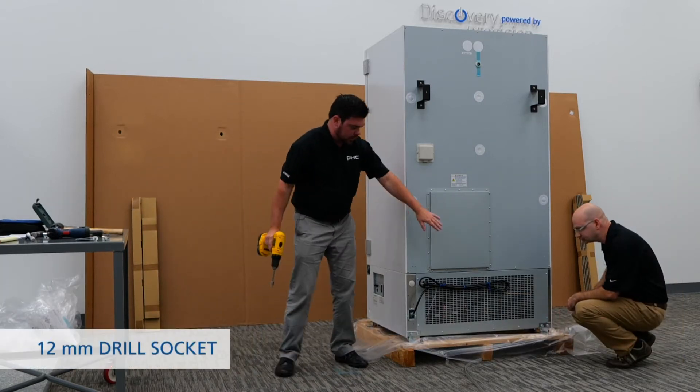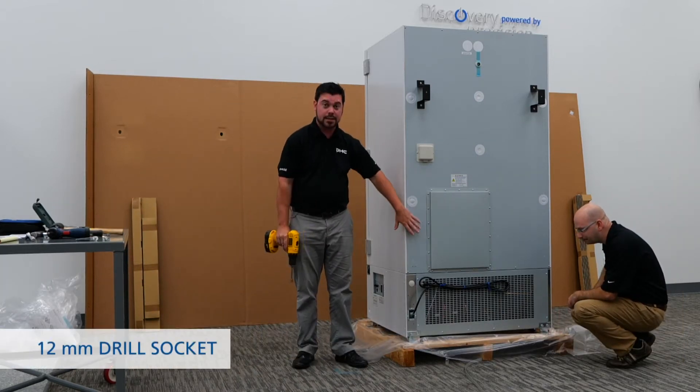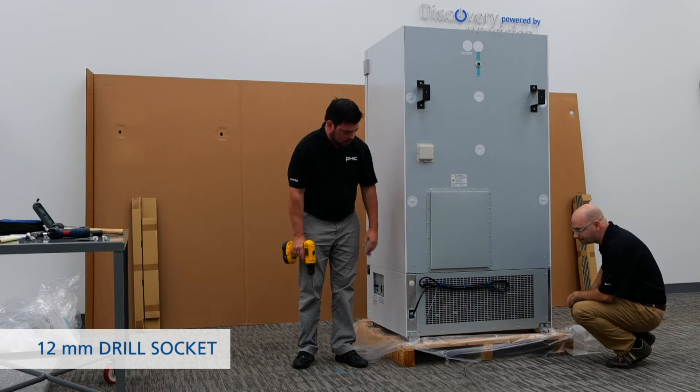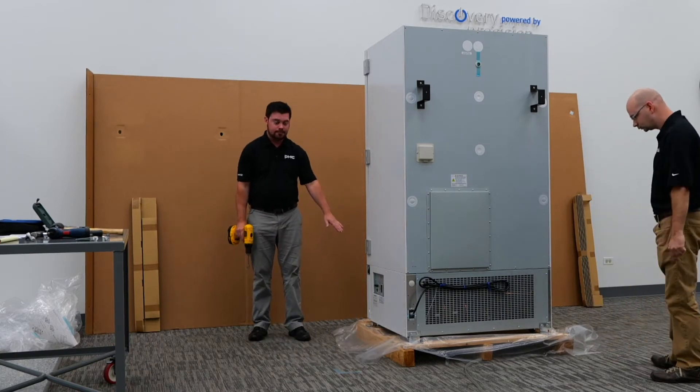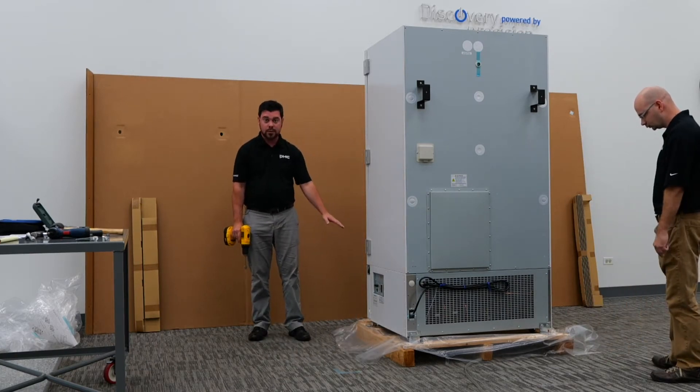For the next steps, you're going to notice two mounting brackets on the back side of the unit. We're going to want to go ahead and remove those brackets to free up the unit from the skid. After that, we'll jump to the front side and do the same thing with a couple more mounting brackets.